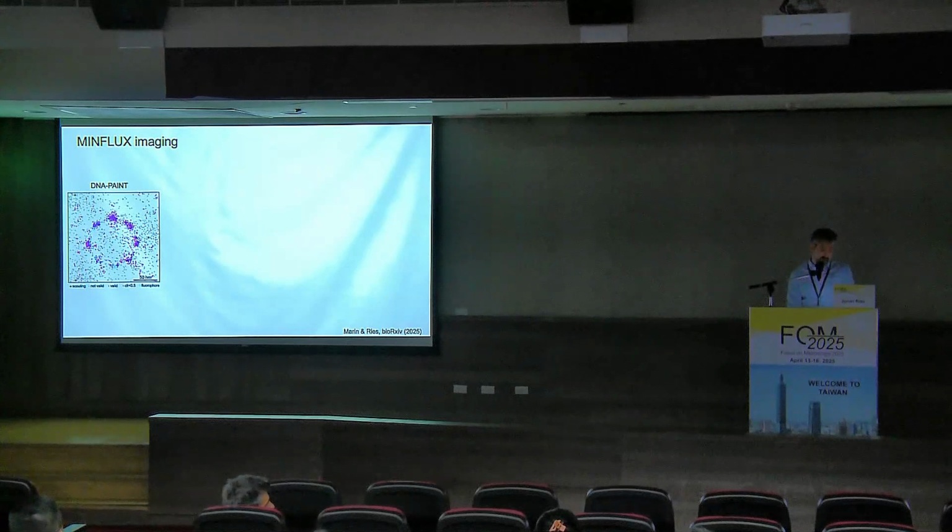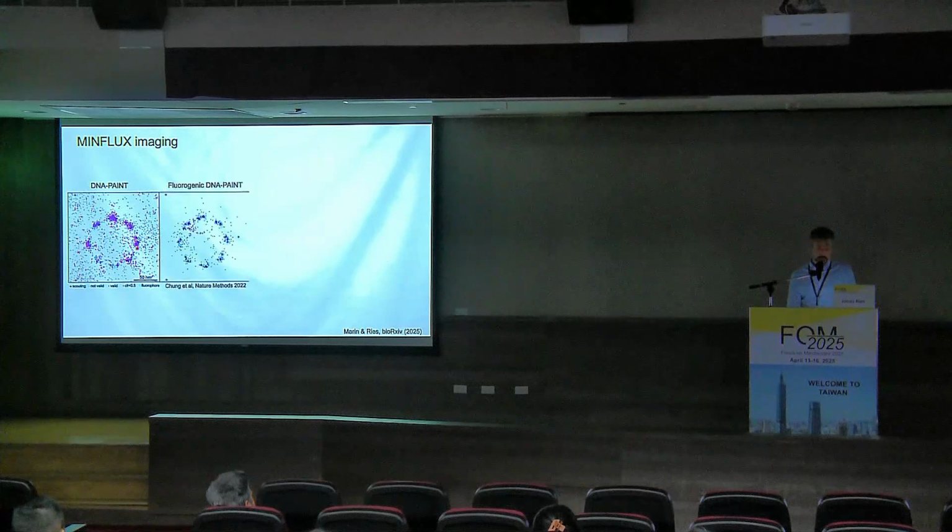And indeed, our simulations of this mode, where we have blinking fluorophores and these diffusing imaging strands, show that we get a lot of invalid localizations all around, and also that those that are valid show a reduced localization precision.